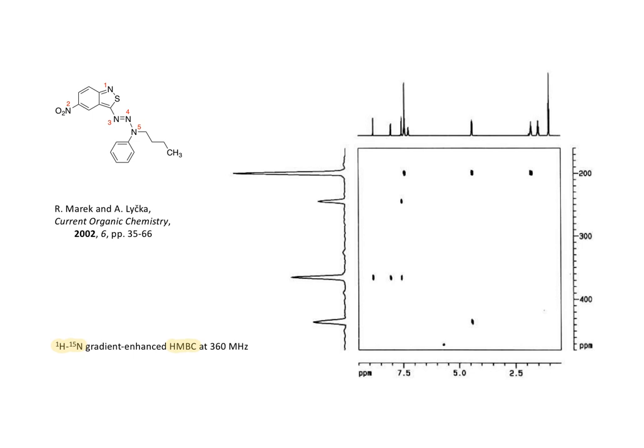Labeling along the N15 axis and the proton axis, it's worth noting that we only know about the nitrogen with this tiny little hump at C because of the 1D spectrum on the previous page.